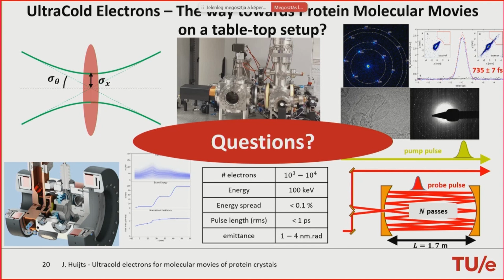Yeah, what I mean is, to get molecular movies, they need to be able to move. So that's why they should be at room temperature. Yeah, that would be a challenge. So I'm not sure that it survives the thawing again. Going back to room temperature, I'm not sure that the crystal survives, but maybe it does, I don't know.